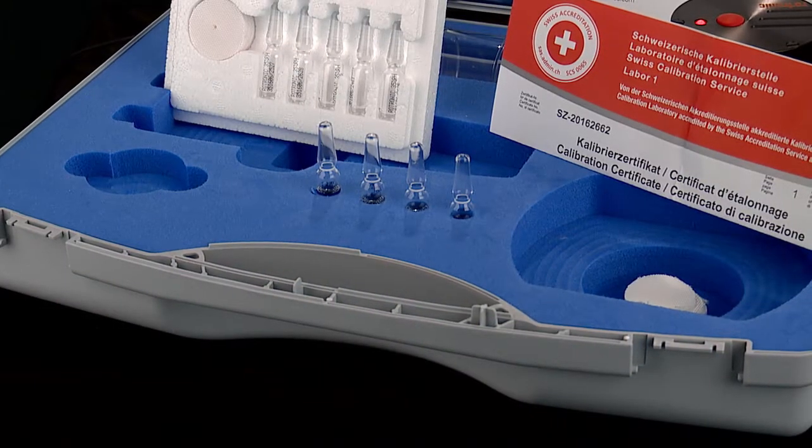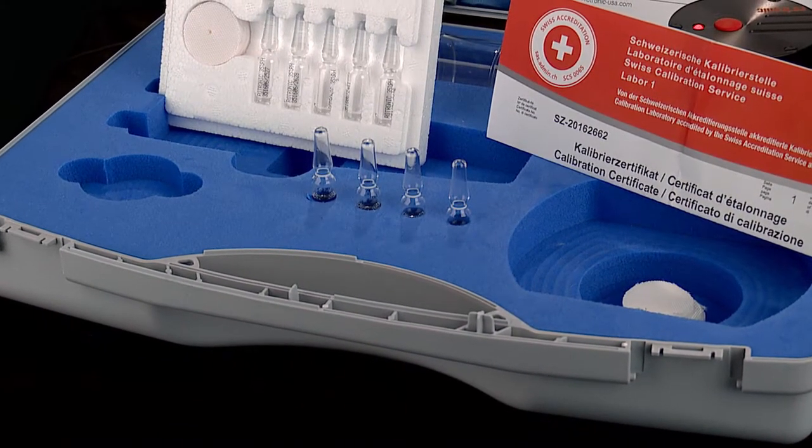In standard practice, we would recommend a yearly calibration, but the cycle is up to the user. In AW measurement, calibration cycles will depend largely on your standard operating procedures, or SOPs. Let's move on to performing a calibration.